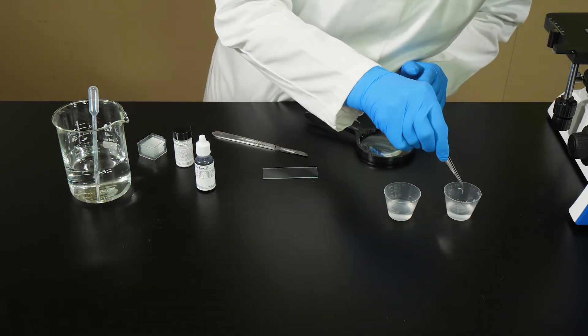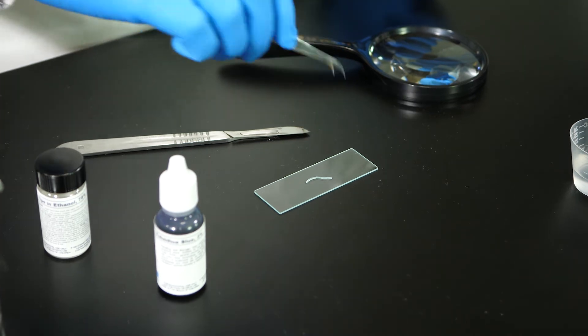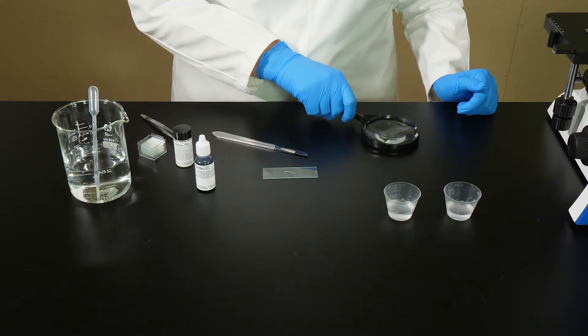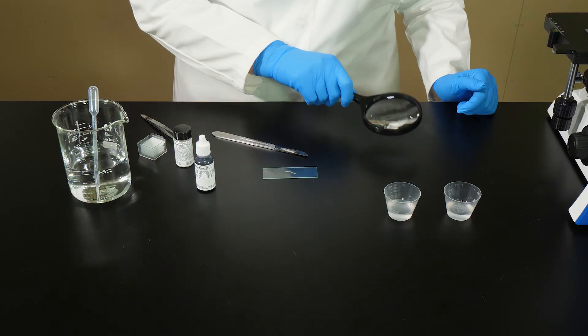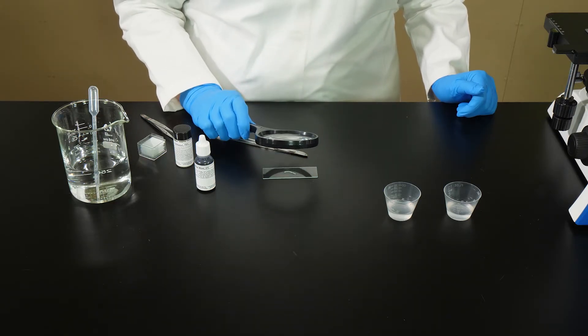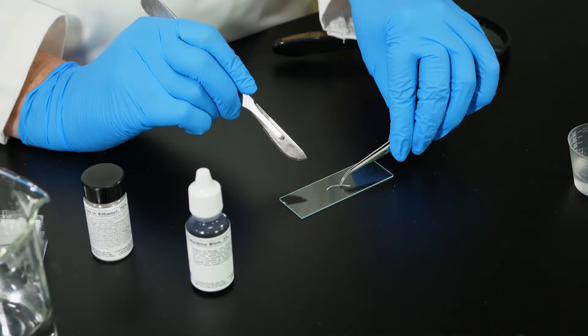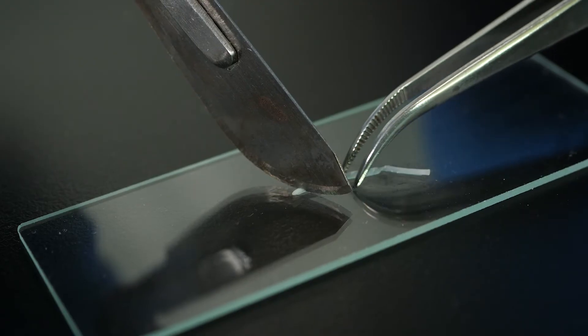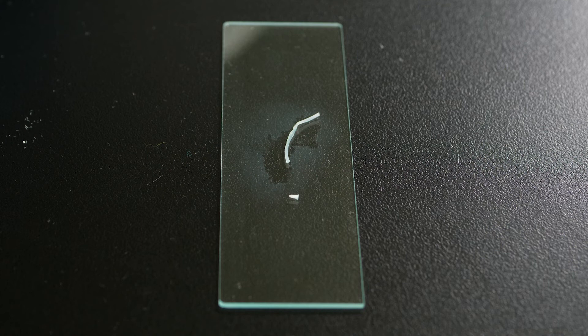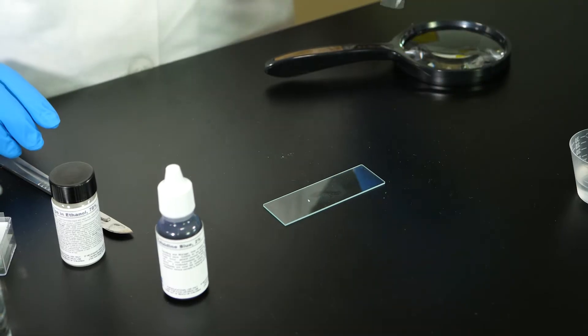After the sample soaks for four minutes, we transfer it to a clean microscope slide. We need to examine the onion root tip to determine which end is the terminal end. The terminal end of this sample is the rounded end. Since the root is so thin, a magnifying glass will help us identify the terminal end. Once we have identified the terminal end of the root tip, we hold it down with the forceps and use a scalpel to slice off a section about two millimeters from the terminal end. This is the sample we will examine. The rest of the root tip can be discarded.